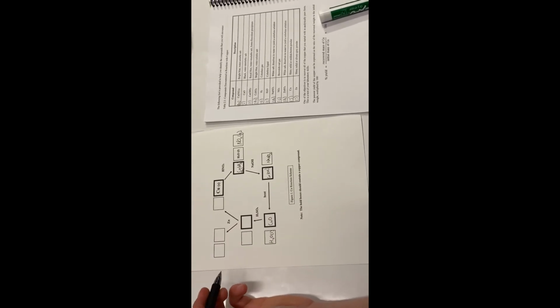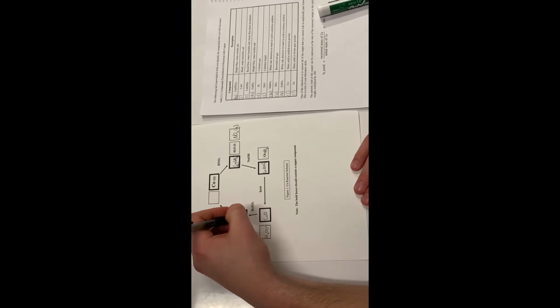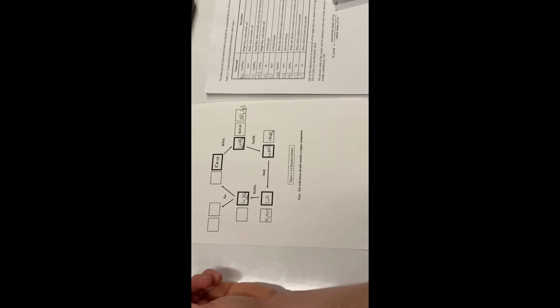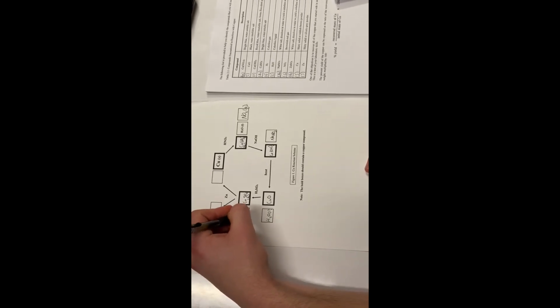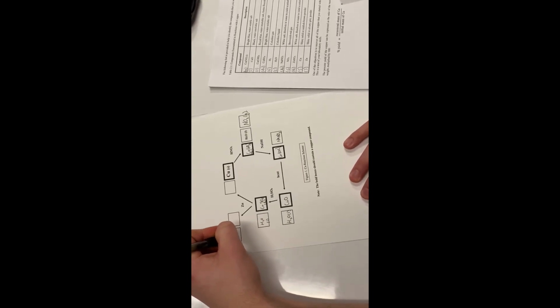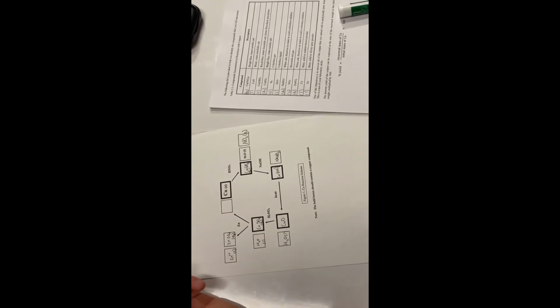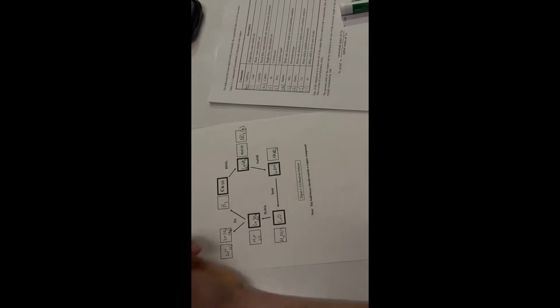Sulfuric acid was then added, causing a reaction that turned the solution to a bright blue color, resulting in the formation of copper sulfate, CuSO4, which is an aqueous solution. Zinc was then added with H2O, which resulted in zinc. So this would be Zn2+, which is a solid, and this would be ZnSO4, which is aqueous. When it was added, there was a bubbling, which released a colorless gas, which is hydrogen. So this box would be H2 for hydrogen.